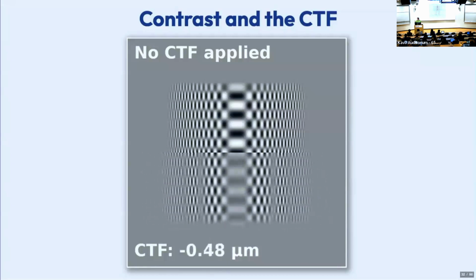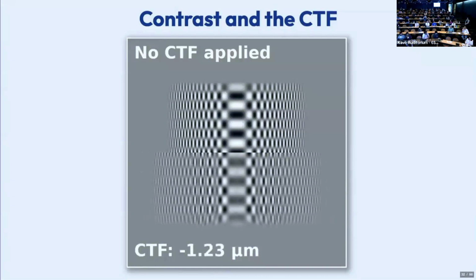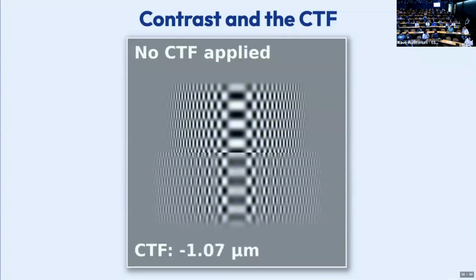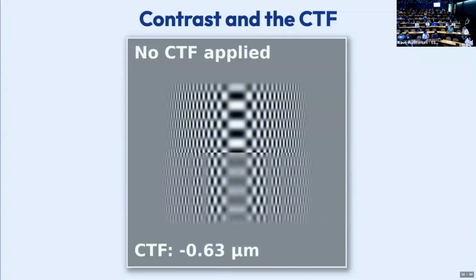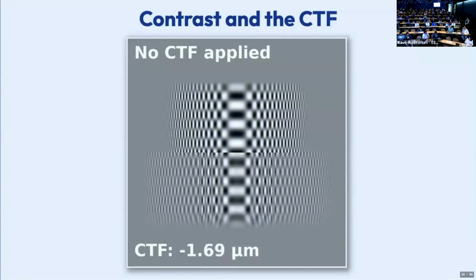Okay, maybe I can help. Yes, you answer definitely. Okay, so as a rule of thumb, if you want to get beyond 3 angstroms, I would strongly recommend your total cumulative dose no more than 20 electrons per square angstrom. And the next question you ask me, how do I know? Well, because I'm old enough to know.